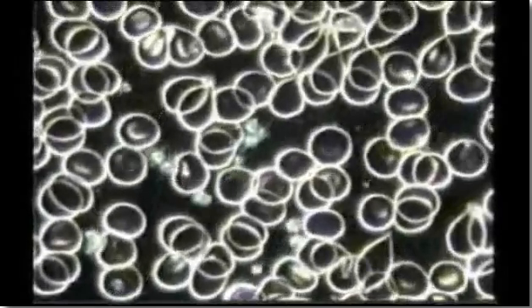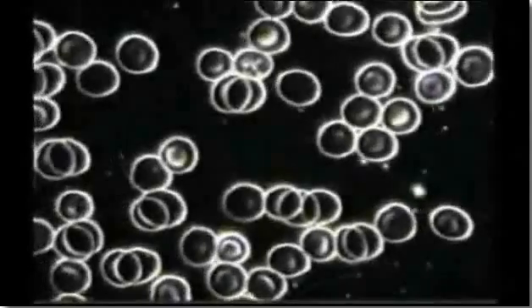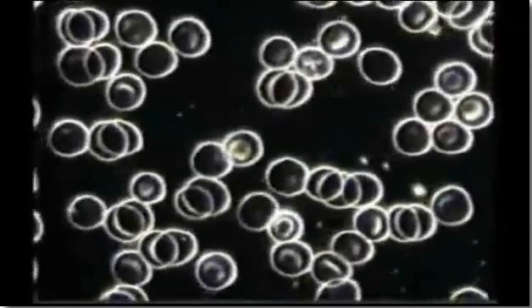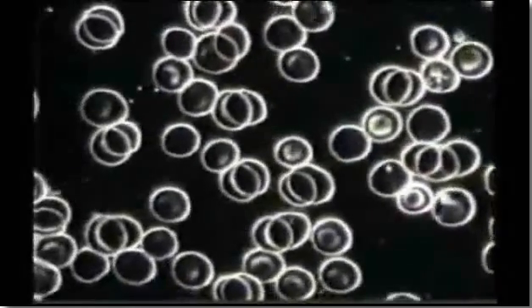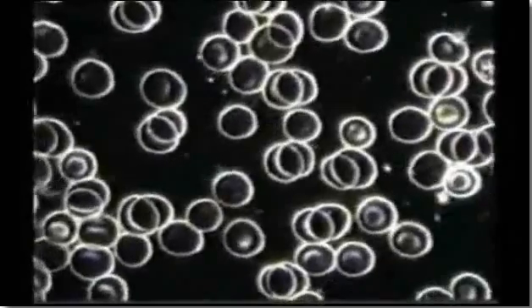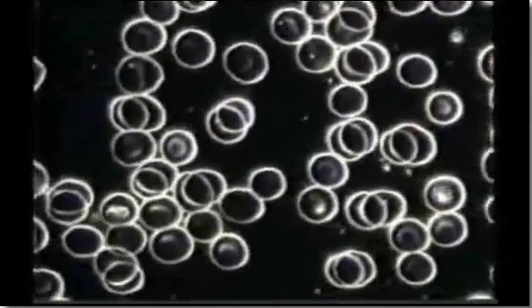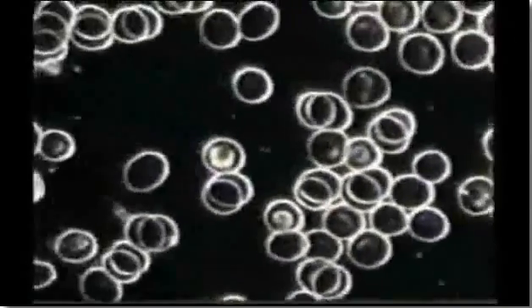Subject number 3 is a man of 64 years young. In the first live blood examination, we can observe a pretty good picture. After 15 minutes of wearing the pendant, look how his blood looks even better. His blood is well oxygenated and the plasma is clean. Observe the greater number of protein particles in the background.